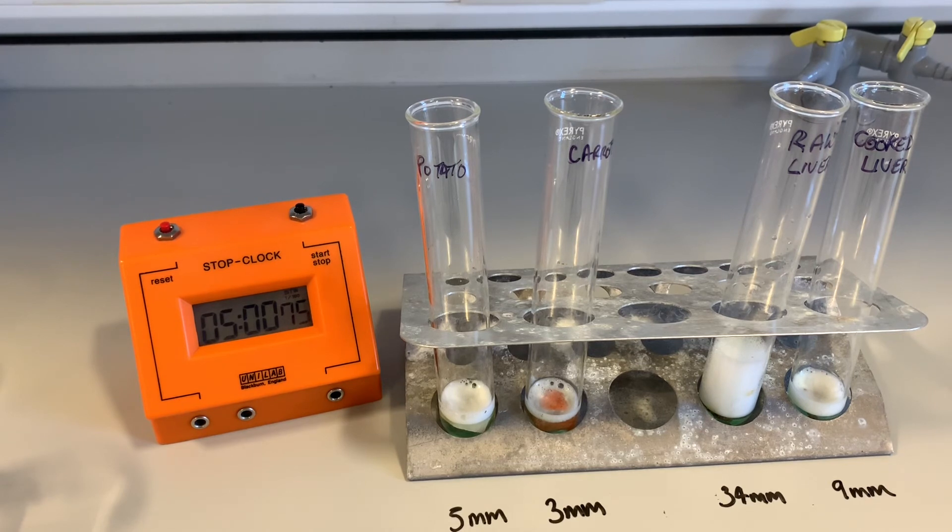You would have expected that the boiled or cooked liver's enzymes would have been destroyed, but maybe it just hasn't been boiled enough. That's one I'll maybe have another look at later on. But you can still see the comparison — the raw liver has got 34 millimeters of froth, whereas the cooked liver has got only nine. So the tissue that has the most catalase activity is the raw liver.